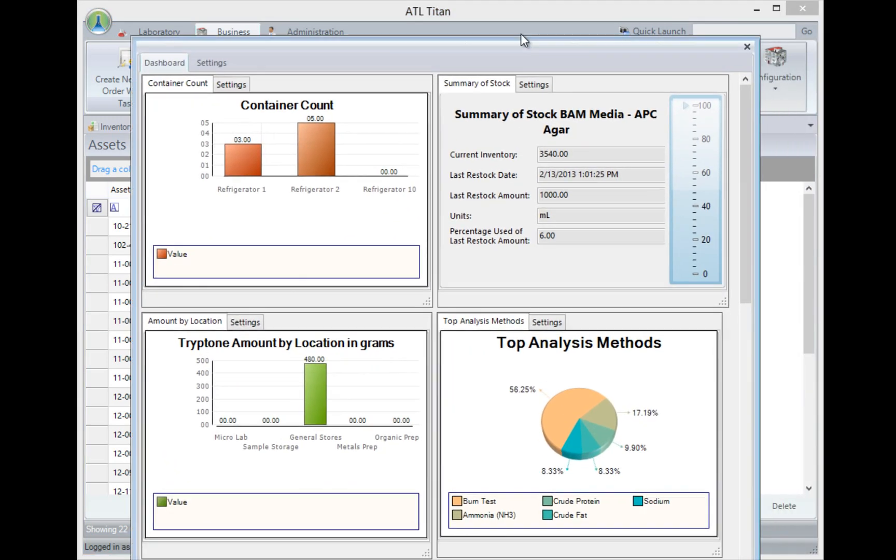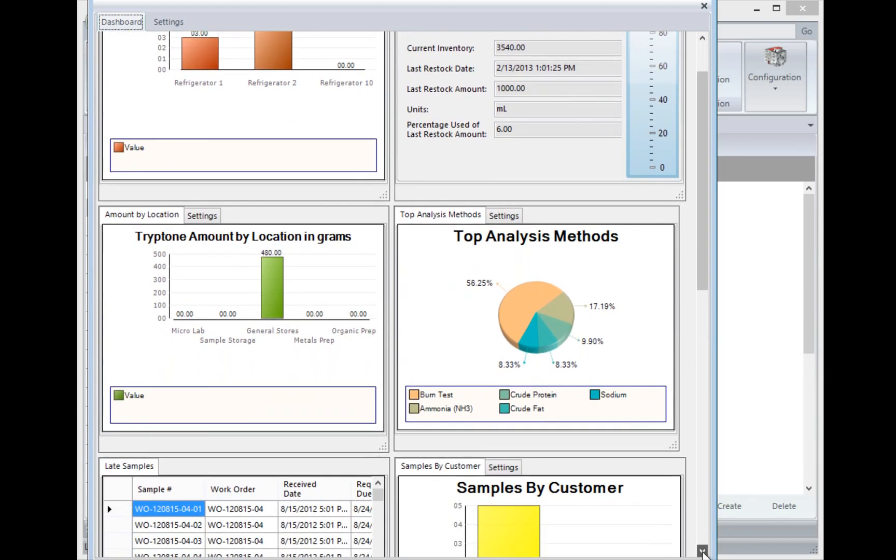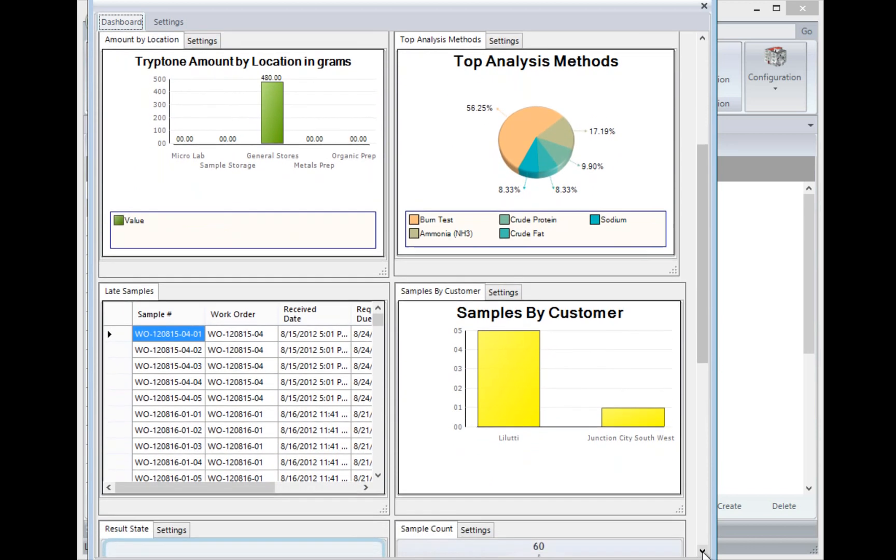Titan also allows us to have a dashboard where we can actually come in and take a quick look and open the dashboard and see how things are. So things like container count, what containers are in different areas, what type of summary of stock do I have, where is my stock stored, what are my top analysis methods. These are just a few items that are late and the number of samples that have been received by customers. So we can bring these different dashboards in here. So I hope this helps you understand a little bit more about Titan and the ways it can be used in an organization as not only just the LIMS, but an ERP for tracking other resources in your organization, all the way down to helping with sales orders and delivery orders.